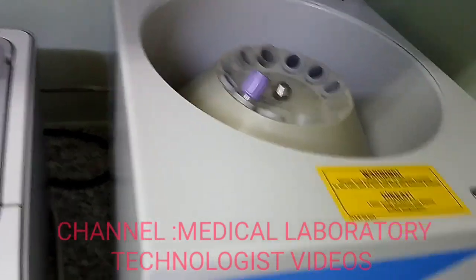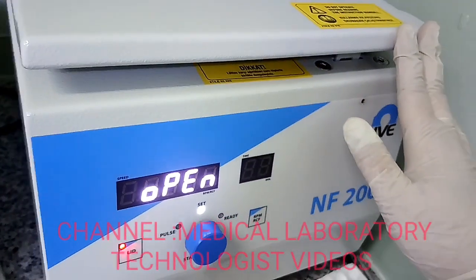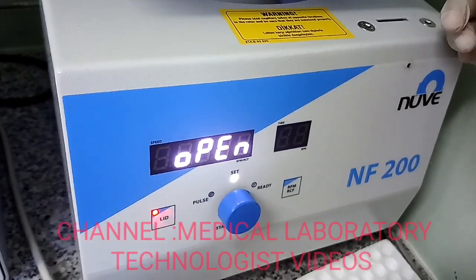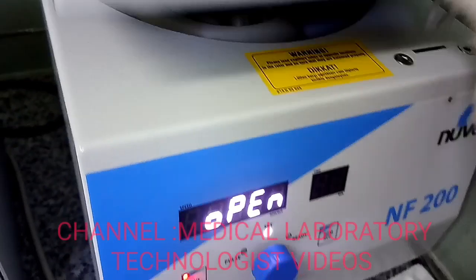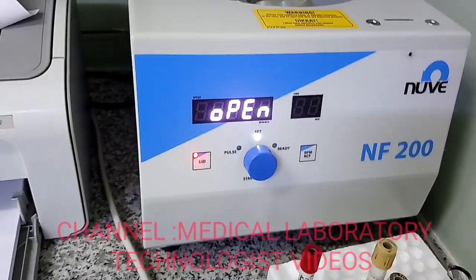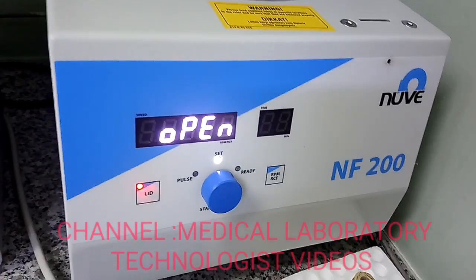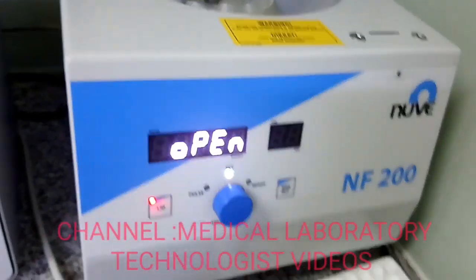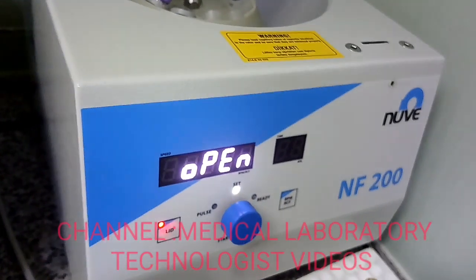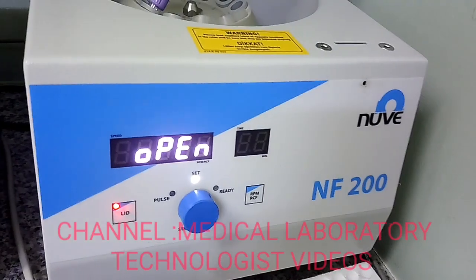Finally, the most important point is that safety is ensured by the steel body lid chamber and lid locking system. I would surely recommend this centrifuge for small to medium level clinics. It is very easy to use and process samples, and because of its weight you have no concern about it moving or being too lightweight. I will definitely recommend the Novi NF-200 centrifuge.